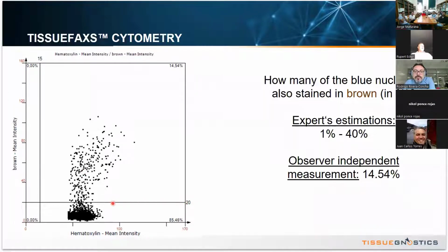And this line here is well known from flow cytometry. It is the cutoff that has to be set in accordance to an isotype matched negative control. Only cells which have a staining intensity greater than the value shown here, 20, will be considered as positive.